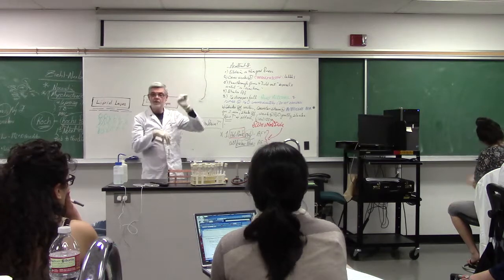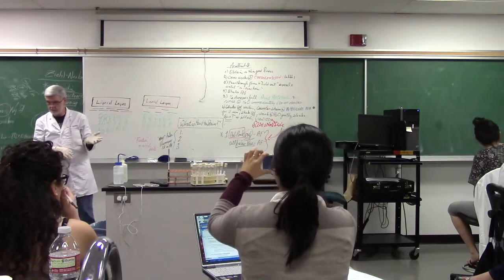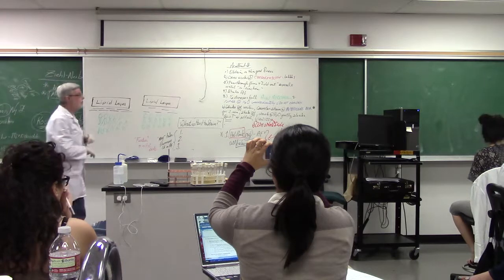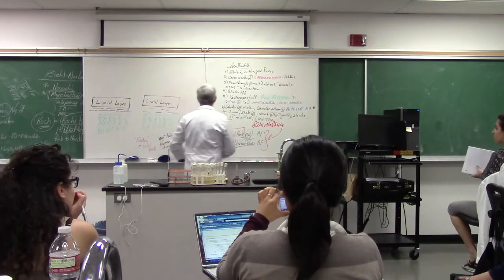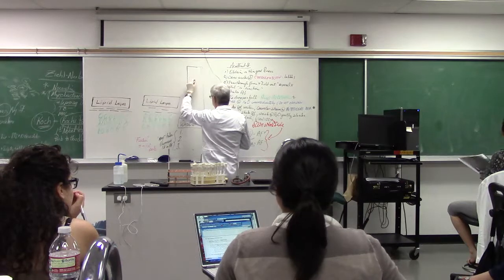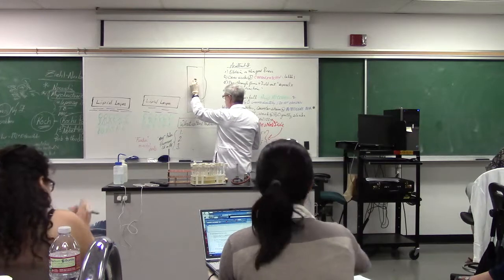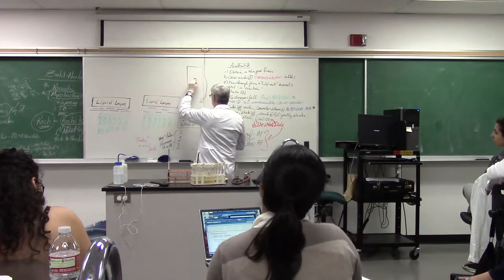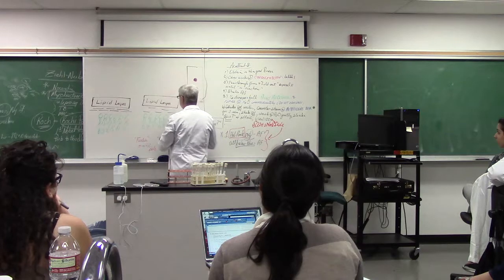And by the way, remember this one, if you're doing Mycobacterium, and we all want you to do a Mycobacterium, but if you do it, remember those chunks, you've got to break them up. All right, and then you're going to take that circle, and by the way, this is one where you're going to have your slide like this, and you're going to put your little circle a little bit past halfway, and you're going to make your smear here, and then you're going to cover this with carbol fuchsin, and you want your slide to look like this when you make it.